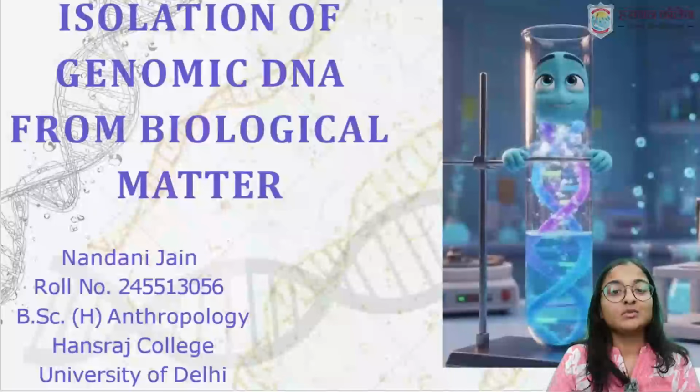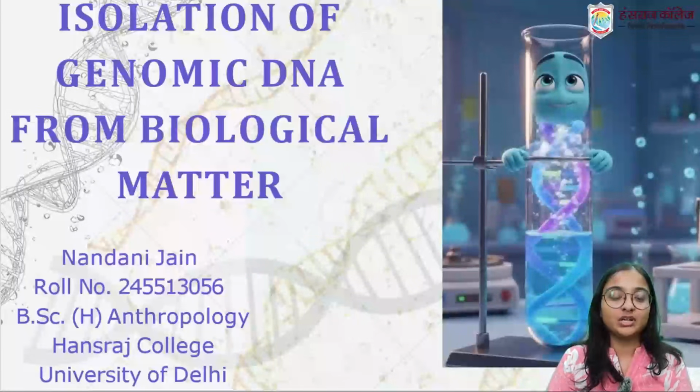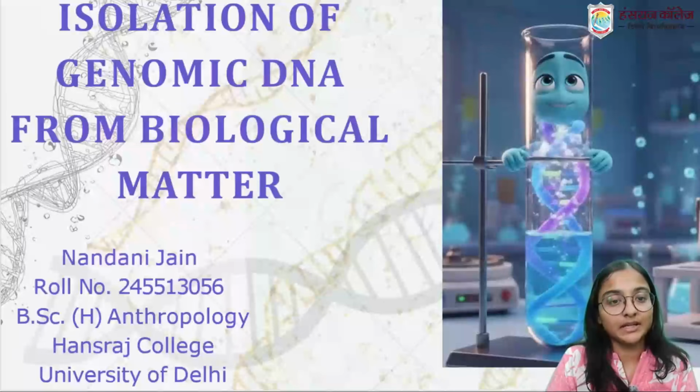Do you know what is the most important step of any genetic study? Well, it is the isolation of genomic DNA.